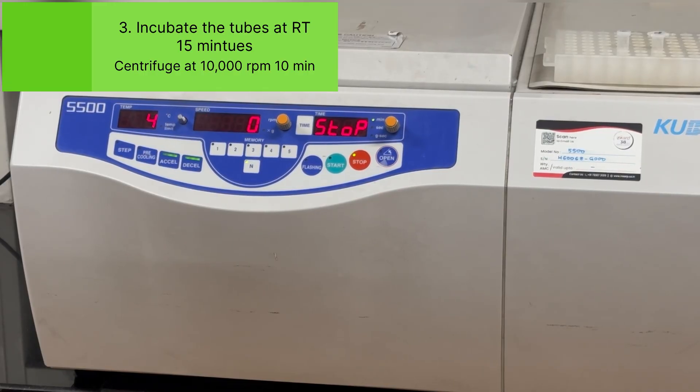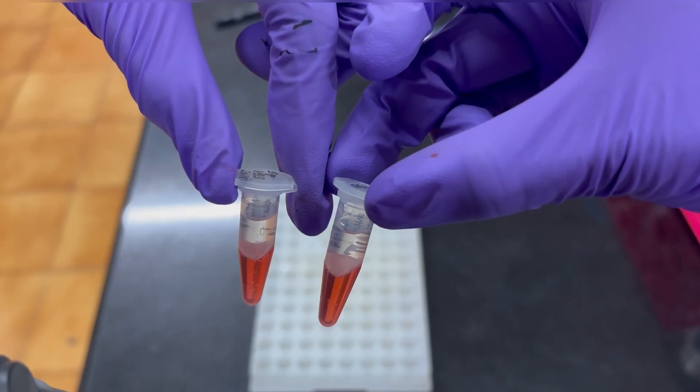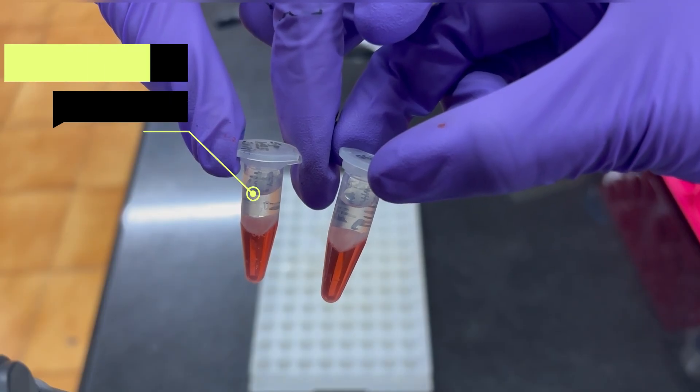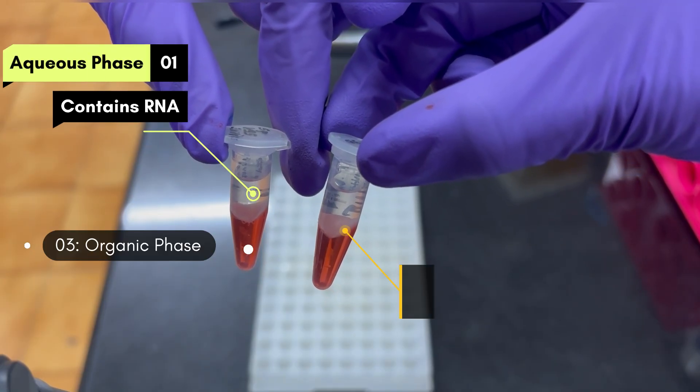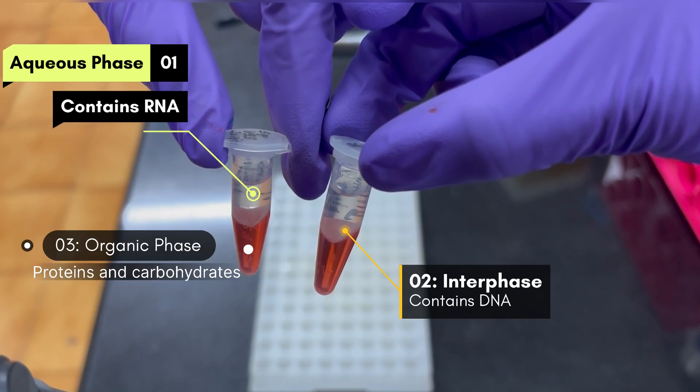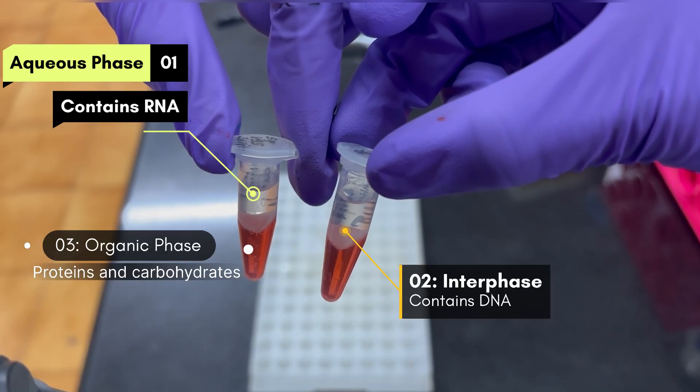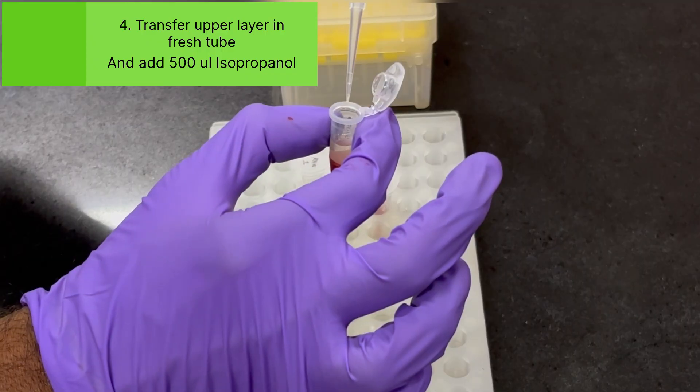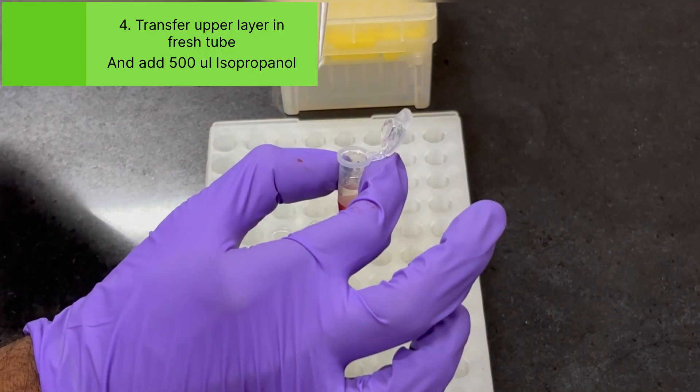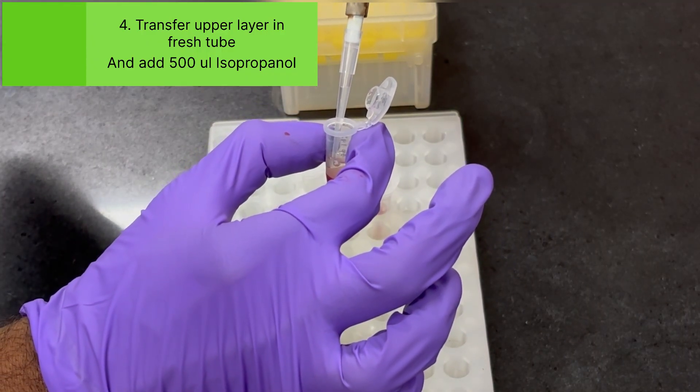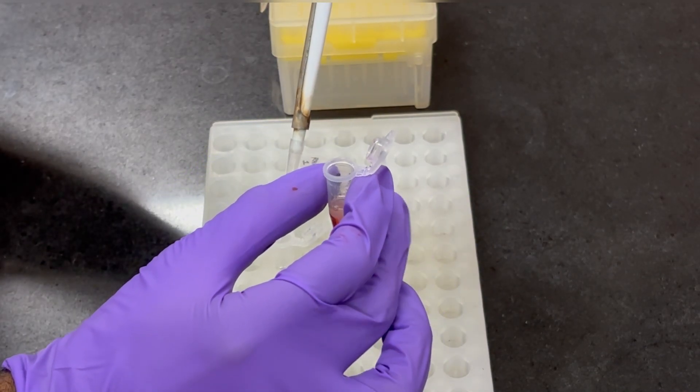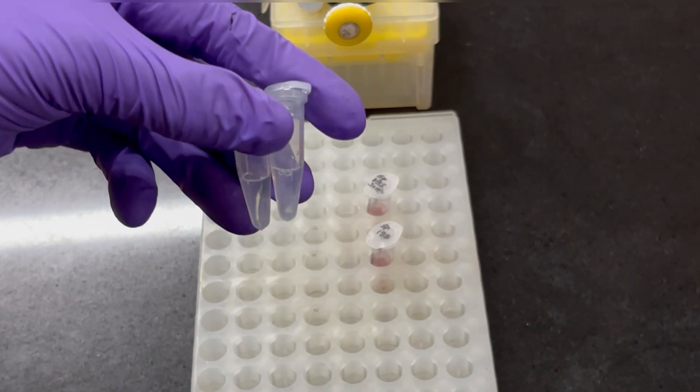So after centrifugation we will get three different layers. The upper layer is aqueous layer, the middle is interphase, and the third one is the organic phase. In our upper aqueous phase, the RNA will be there as it dissolves in water. After phase separation, transfer the upper aqueous layer into the fresh tube and make sure that you are not mixing the layers together. So this is how it looks after taking the upper aqueous phase.